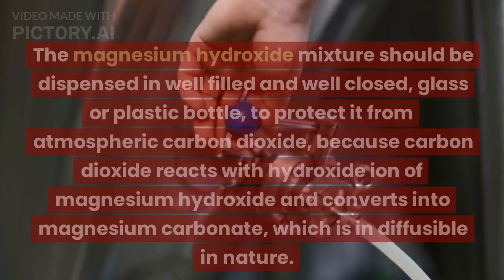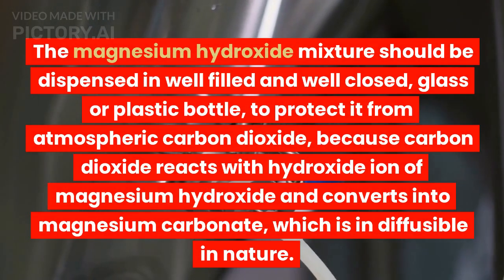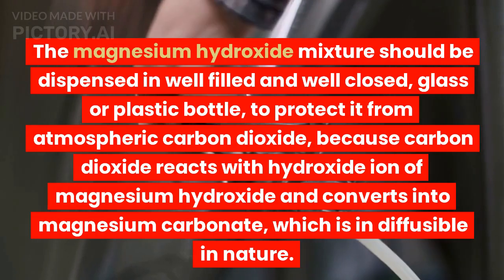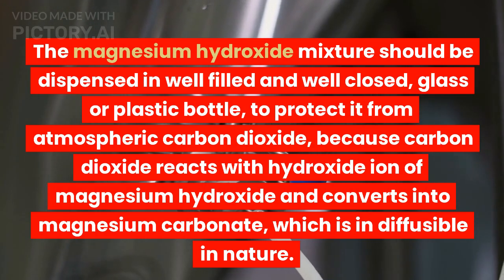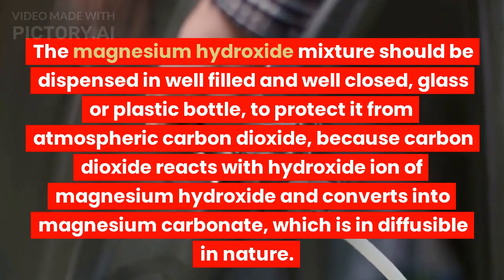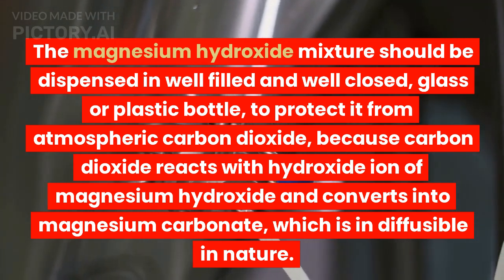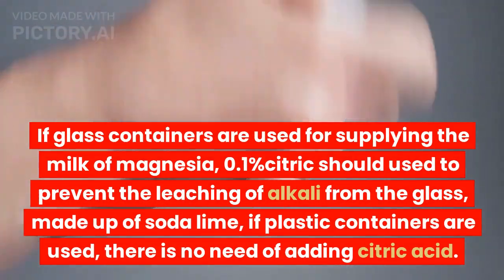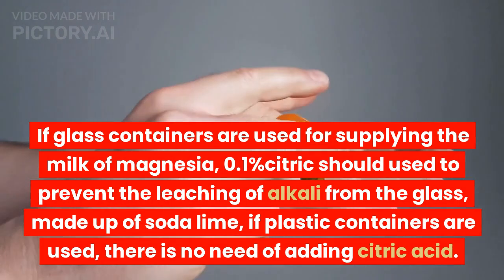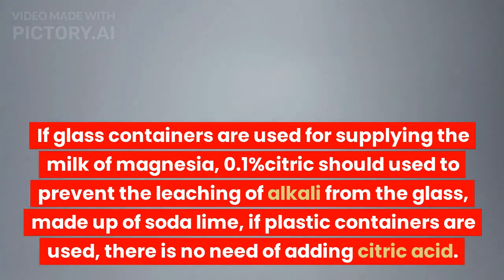Dispensing: The magnesium hydroxide mixture should be dispensed in well-filled and well-closed glass or plastic bottles to protect it from atmospheric carbon dioxide, because carbon dioxide reacts with the hydroxide ions of magnesium hydroxide and converts it into magnesium carbonate, which is indiffusible in nature. If glass containers are used, 0.1% citric acid should be used to prevent leaching of alkali from soda lime glass. If plastic containers are used, there is no need to add citric acid.